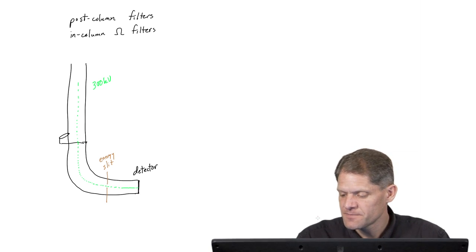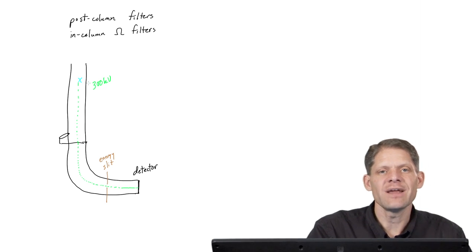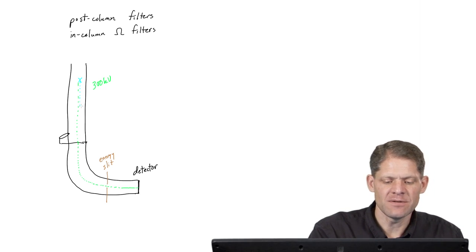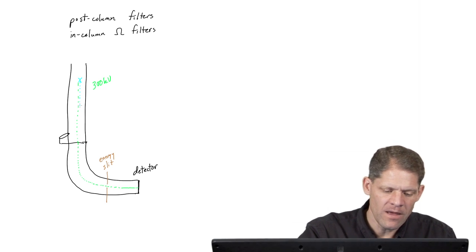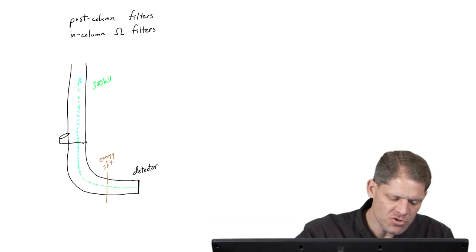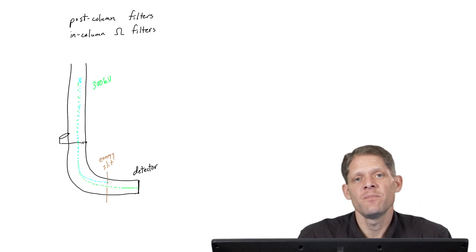On the other hand, electrons that, after they hit the sample, are inelastically scattered and emerge at lower energy, perhaps 20 eV lower, perhaps 100 eV lower. As these go through the column, because they're of lower energy, they are bent more strongly by the prism. They hit the energy slit and are absorbed there and are removed from the image.